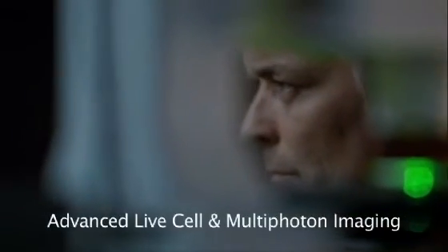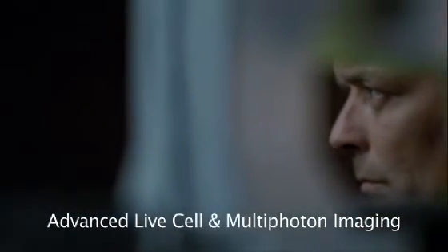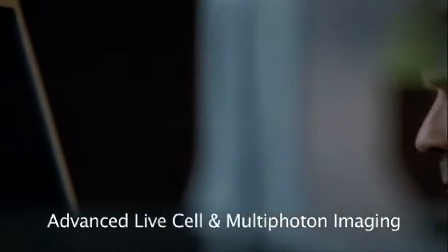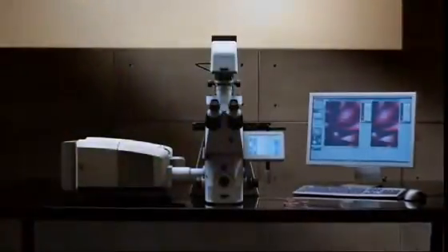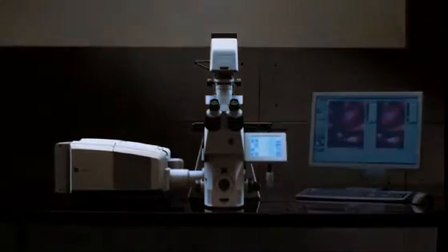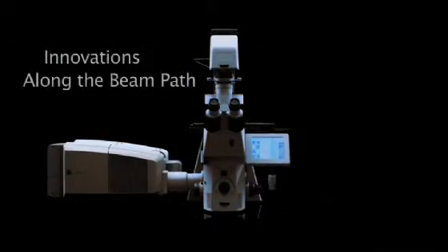It also offers optimal conditions for live cell imaging, and with its innovative detection technology and shortest light paths, the LSM 710 with NLO now delivers even deeper penetration for multi-photon imaging.